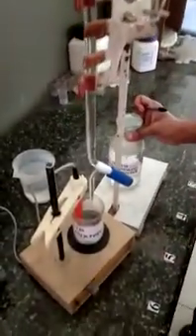The experimental setup is done like this. Dip the conductivity cell inside the acid mixture given in the beaker, switch on the magnetic stirrer, and fill the microburette with the given standard sodium hydroxide solution. It is a base, and it reacts with the acid mixture, neutralizing it into salt and water. Let's see the variation in the conductance and note it down in the tabular column.